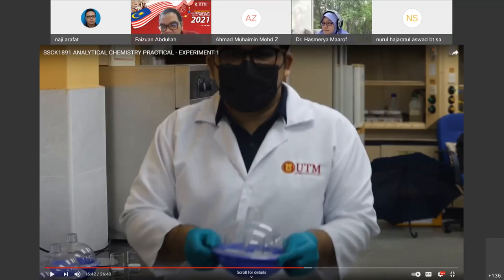Yes, the silica gel inside the desiccator will absorb the excess water, even though it is already in the oven, but then the moisture is still there. All right, good answer from Chong and everyone in the chat room. Because it will absorb the moisture from the ambient air, right?